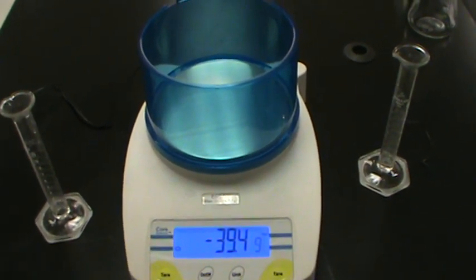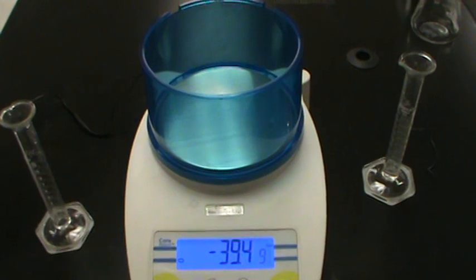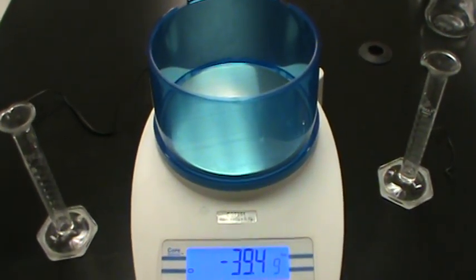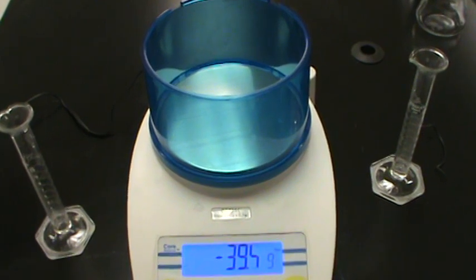You'll remember in a previous video we were able to show that one milliliter of water weighed one gram.